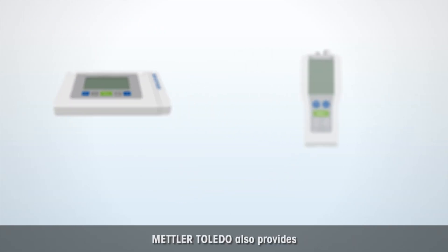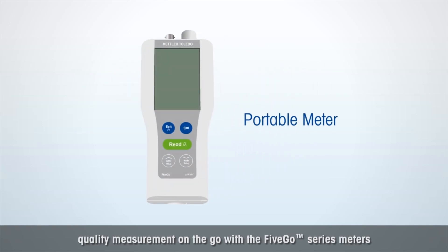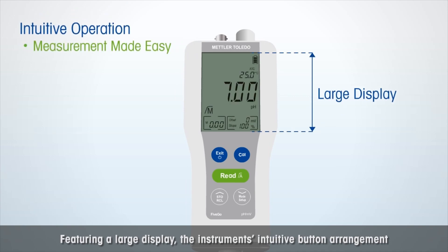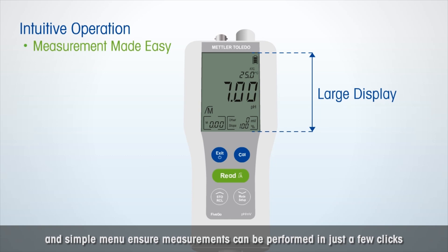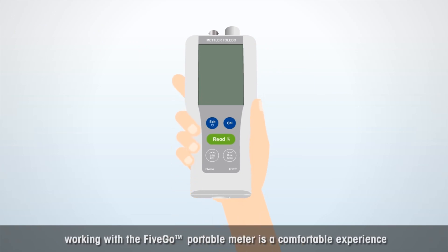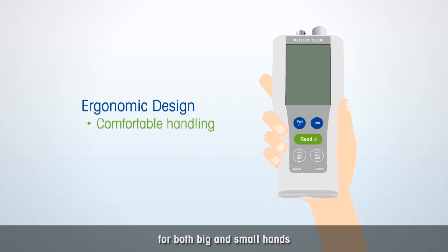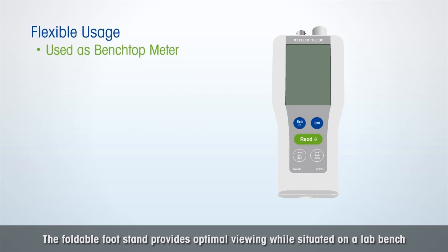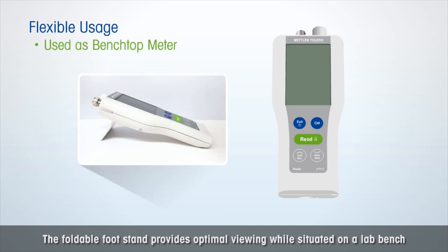Mettler Toledo also provides quality measurement on the go with the Five Go Series meters. Featuring a large display, the instrument's intuitive button arrangement and simple menu ensure measurements can be performed in just a few clicks. Thanks to its ergonomic design, working with the Five Go portable meters is a comfortable experience for both big and small hands. The foldable footstand provides optimal viewing while situated on a lab bench.